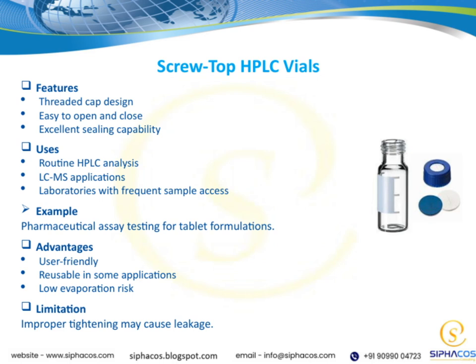However, it's important to remember that improper tightening can lead to leakage. So ensuring the cap is securely tightened is key to avoiding sample loss or contamination. Overall, these vials are a practical choice in many analytical settings, provided you pay attention to proper sealing.